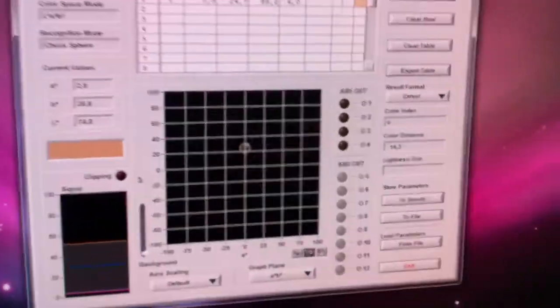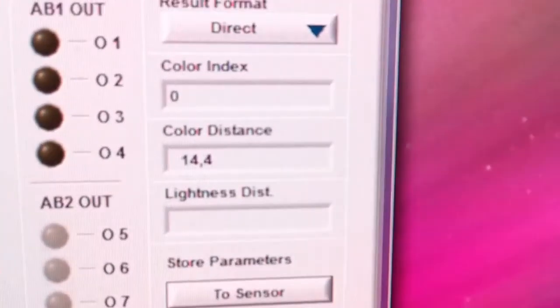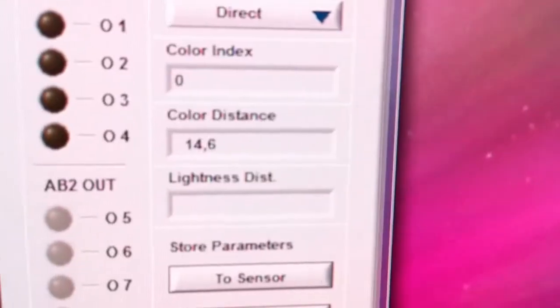But it's enough to get a color difference of nearly 15.